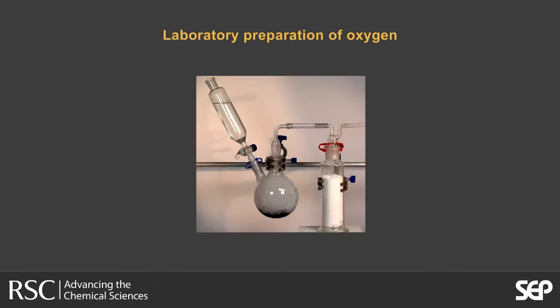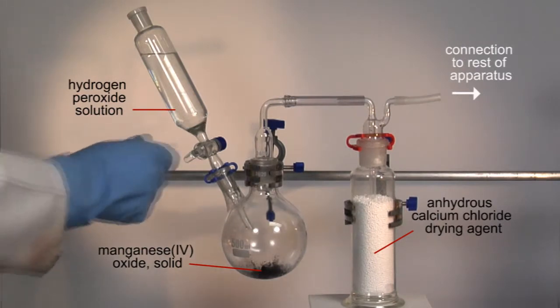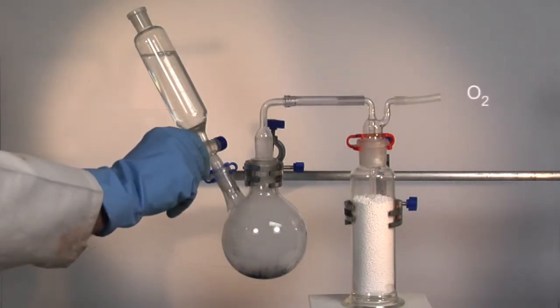Oxygen can be produced by the decomposition of hydrogen peroxide. The compound slowly decomposes into water and oxygen, but the reaction is greatly accelerated by the addition of a catalyst.